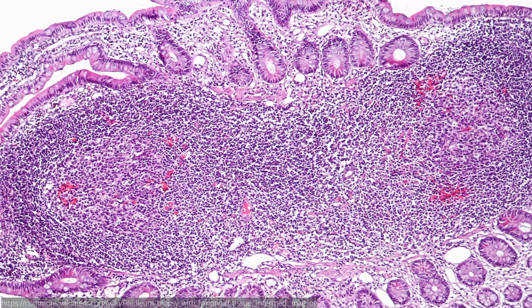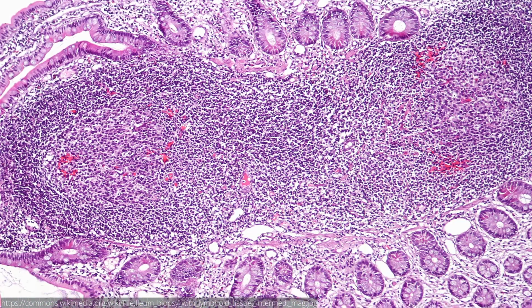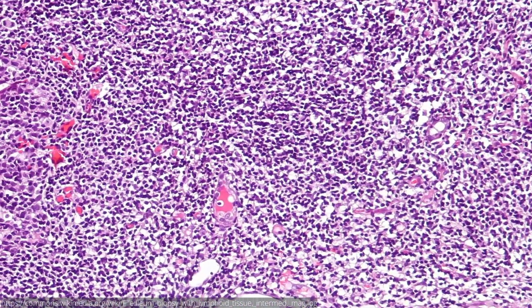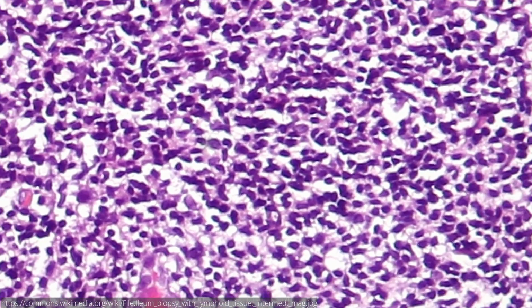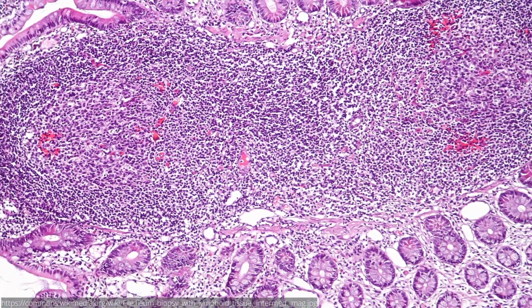A microscope allows us to view tiny structures of a specimen by using objective lenses. But when we zoom in to view finer details, the field of view is now limited to a small region. What if we wanted a high-resolution image but still covering a wide field of view?